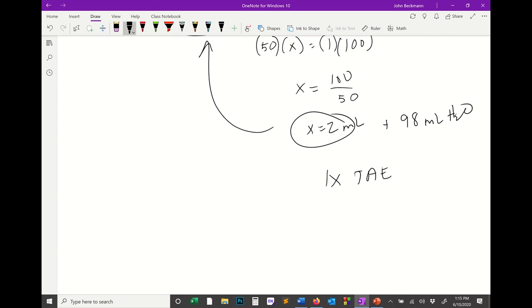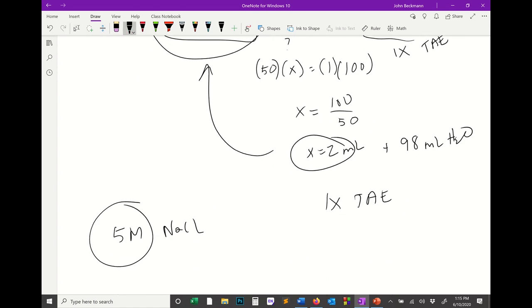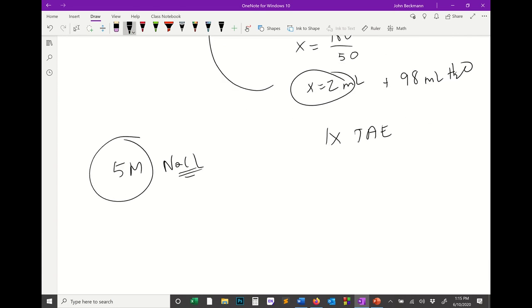So what we've noticed, again, is that the units of our solution are not the canonical chemistry units. When we made the working solution of sodium chloride, it was a 5 molar solution of sodium chloride. That all made sense to us. But sometimes when we make buffers, we don't say 5 molar, because there might not be just one thing in it. It works for sodium chloride because there's just one thing in it. But TAE is actually a solution of 3 separate things.